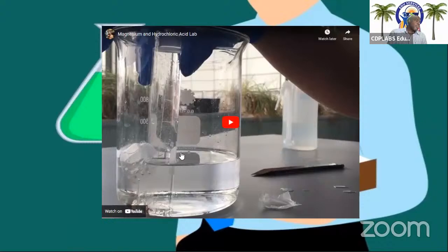All right. So once again, you see the test for hydrogen itself. So that you should not forget that test at all. You see it twice. You have heard it with your ears. So hopefully you'll not forget it. And of course, you'd have realized that with the acid, the magnesium reacted much quicker with hydrochloric acid than in water. All right? Okay.